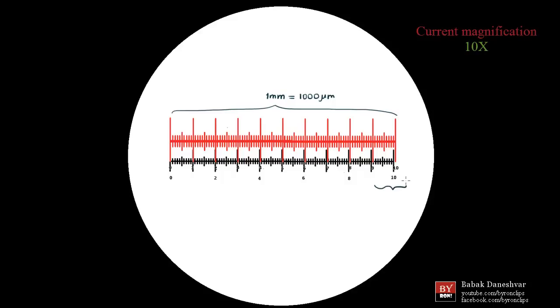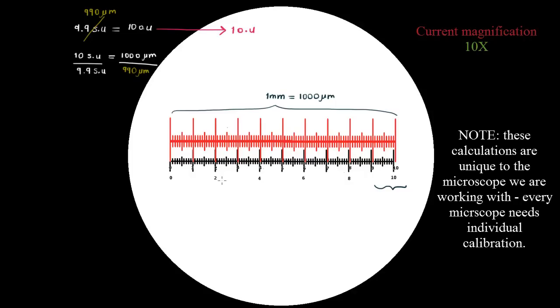Now if you look over here you'll notice that the ocular ruler and the stage ruler are not lining up perfectly. To be precise, 9.9 stage units, 9.9 units of the stage micrometer are lining up with the entire length of the ocular ruler, ten ocular units. Now I already mentioned that ten stage units, or the entire length of the stage micrometer is 1000 micrometers. Which means that the length that we have now, 9.9, has a physical length of 990 micrometers. Which is great because now we know that ten ocular units equal 990 micrometers, allowing us to conclude that one ocular unit equals 99 micrometers.